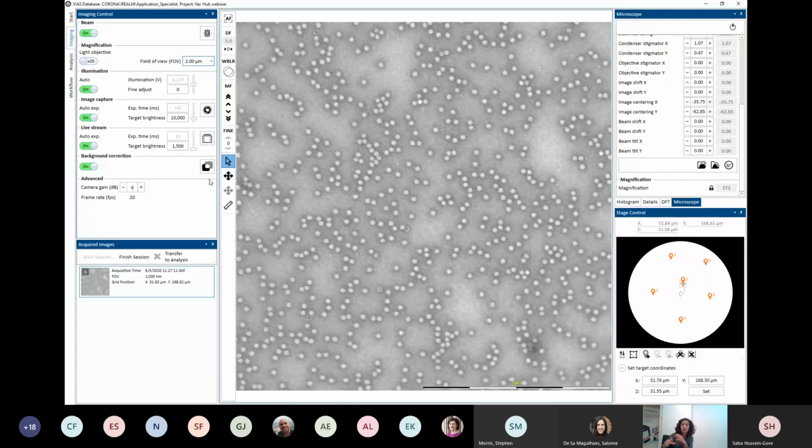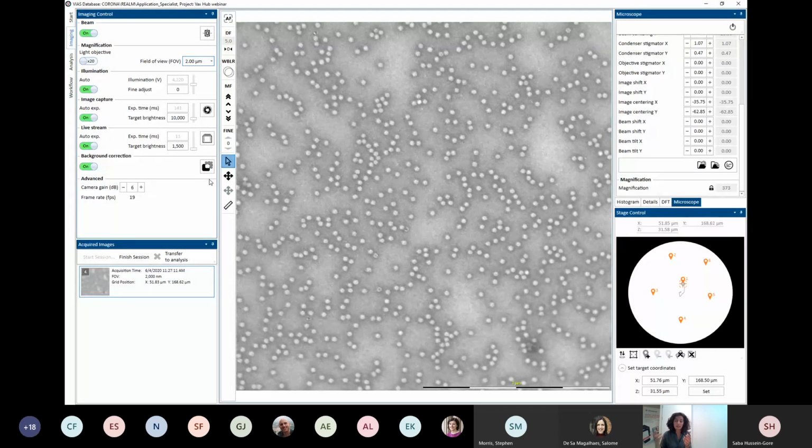You can use it to run big analysis, but you can also use the system just to have a quick look and check how your sample looks, like when you're looking at your cells and splitting them and checking that they look okay. The idea, I think, is to also be able to do that.